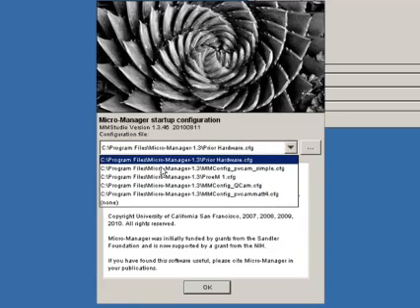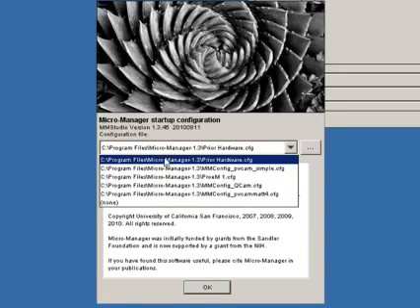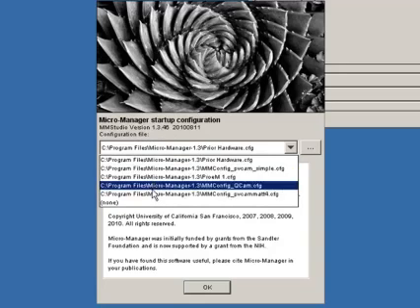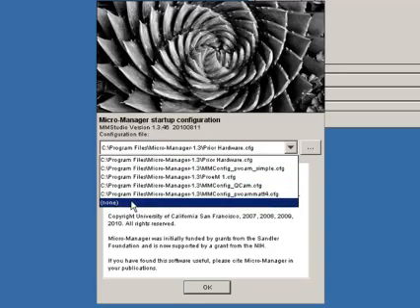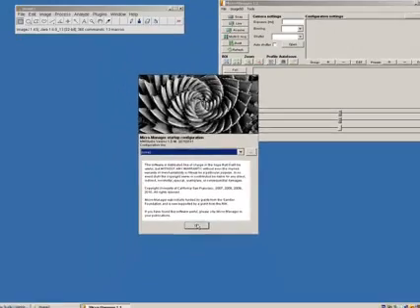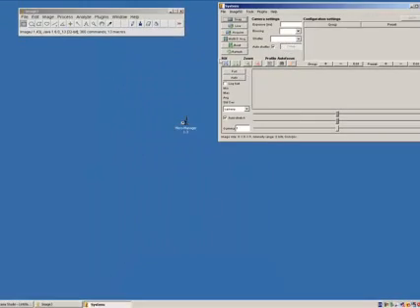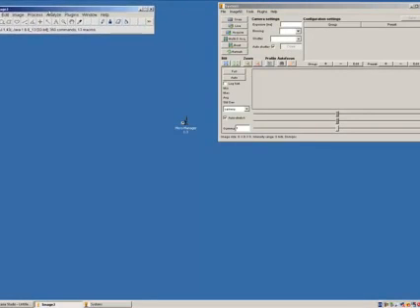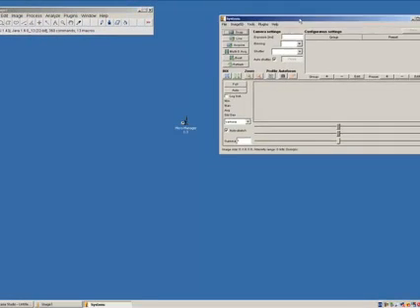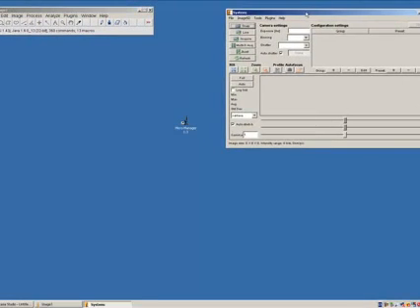When you're configuring Micromanager, the easiest thing to do is open up the software and you'll see this configuration screen here to start off with. If you go for the none, then we can create a new configuration file which is the best way to go. So, if I click OK, I'll open up the ImageJ software here and we'll get our control dialog box over here.